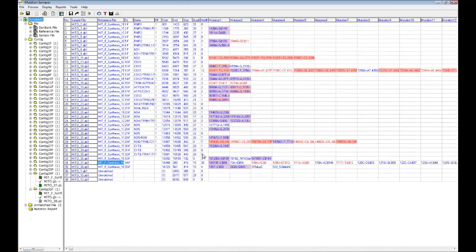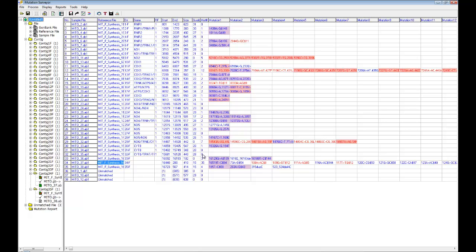Mutation Surveyor groups mitochondrial sample files and assembles detected variants into a mutation report in the same way as it does with nuclear sequence data. Variants are detected using the same physical trace-to-trace technology using a comparison of a sample trace to a reference trace. All variants can be viewed in the graphic analysis display in the same way as nuclear DNA.